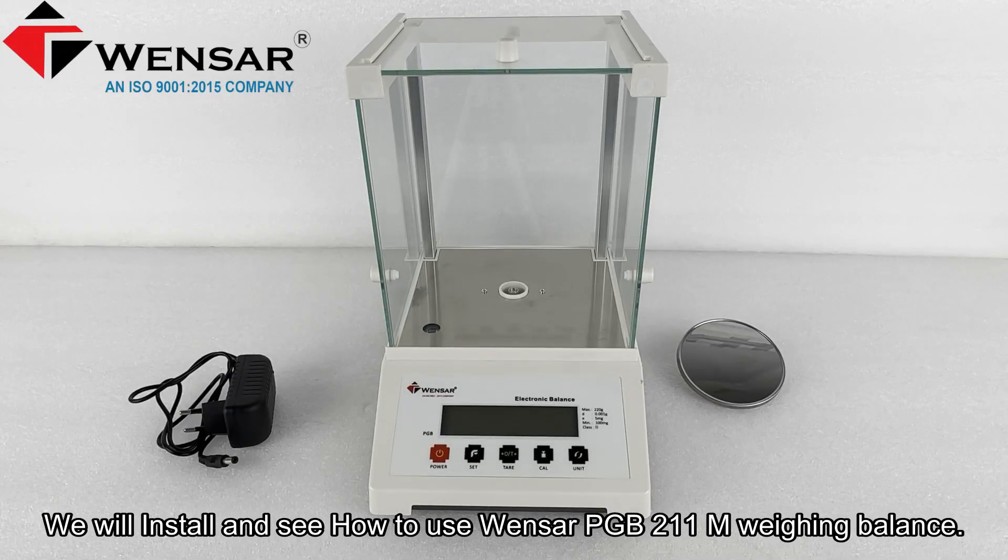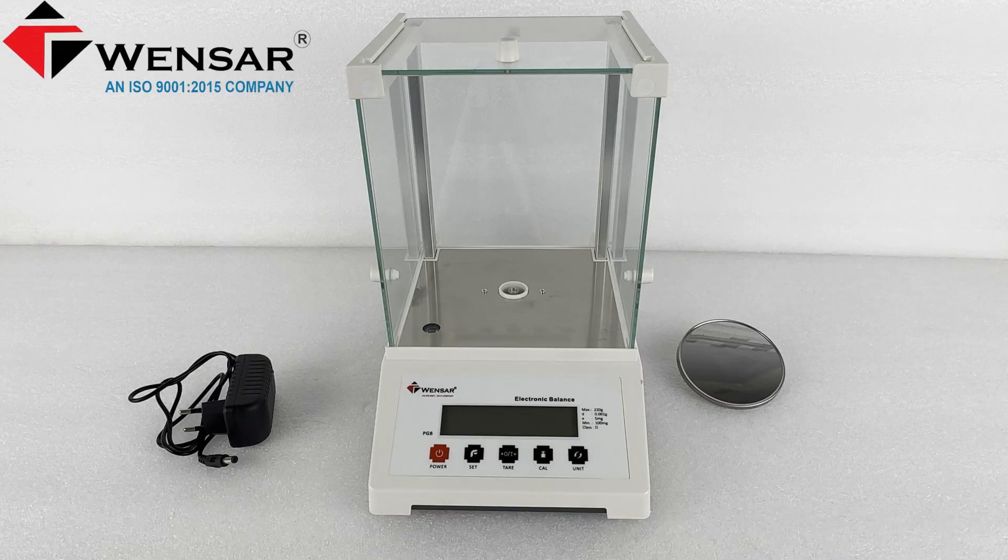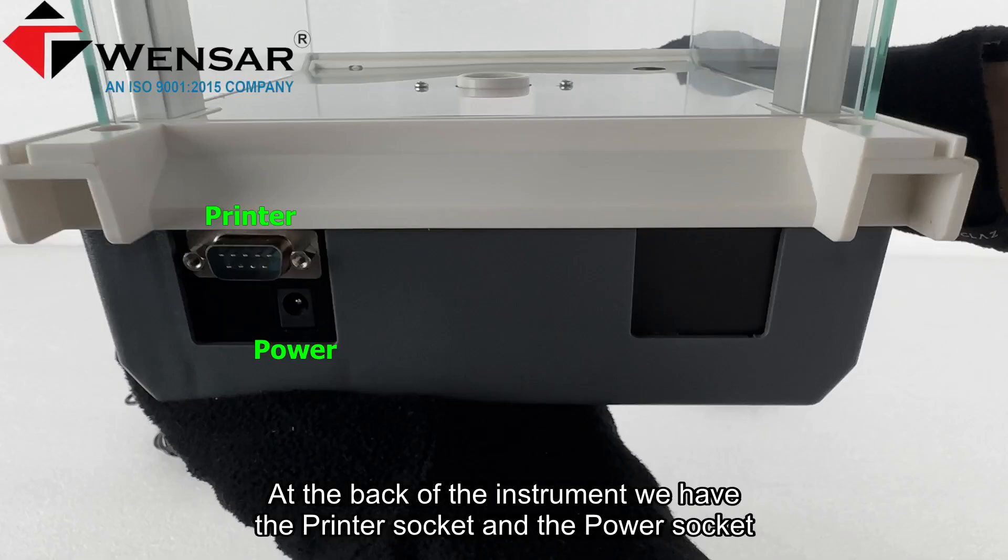We will install and see how to use the Wenser PGB 211 M weighing balance. At the back of the instrument we have the printer socket and the power socket.